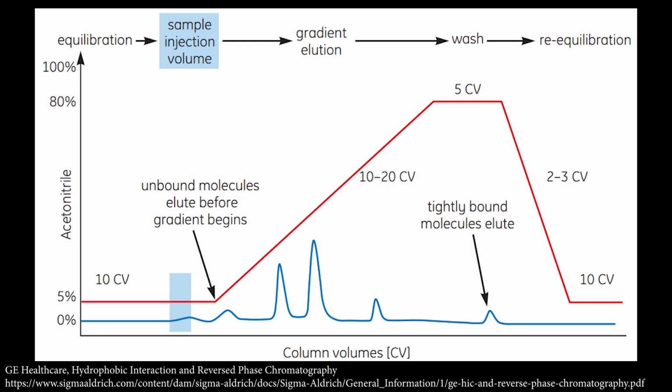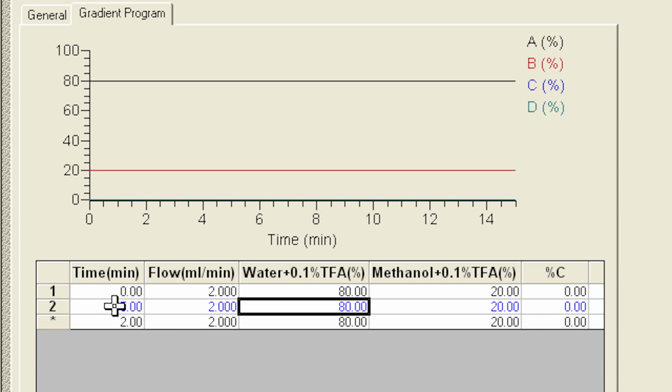It's not analytical time. You turn the detector off and you're just letting the instrument re-equilibrate so that it's ready for the next run. In GC, if you run a temperature gradient, the GC also has to do this, but it's an oven. It just opens up the back of the oven and blows the hot air into the room, and it goes much quicker. So it's much quicker, if you can get away with it and you're going to run 20 runs, to just run an isocratic run. But the things you're running need to be pretty close in polarity. When you have things that are very different in polarity in a mixture, you need to run a gradient. Let's look at one example of doing this with software.